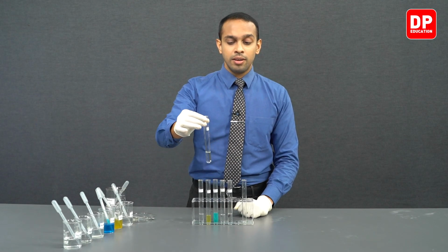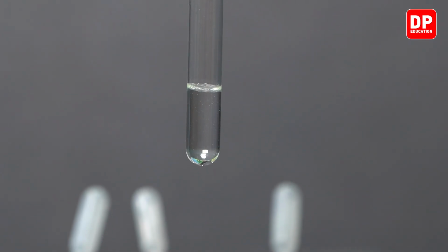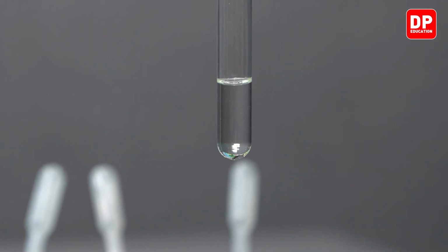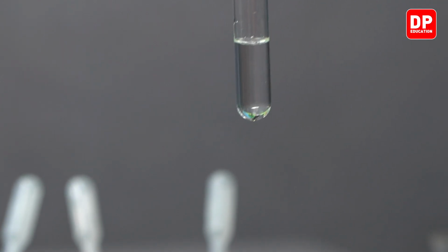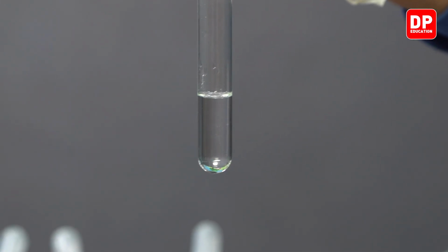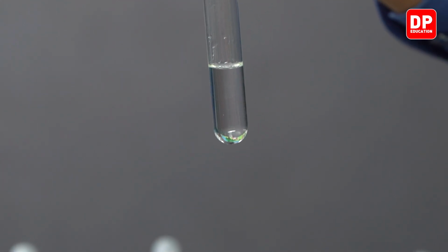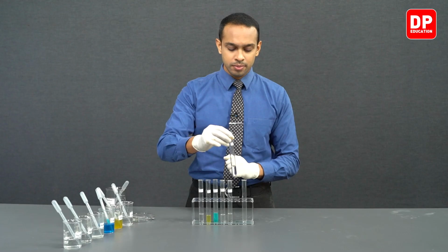And finally, we have sodium 1 plus ion solution, and we can see over here there is no reaction observed as well. So in this experiment we are going to observe if there has been any reaction or if there's going to be any color change or a precipitate observed. In this case, no new precipitate is observed, only the lead pieces we added to the solution are present at the bottom of the test tube, and there's no color change as well, indicating that sodium 1 plus ion solution did not react with lead metal.